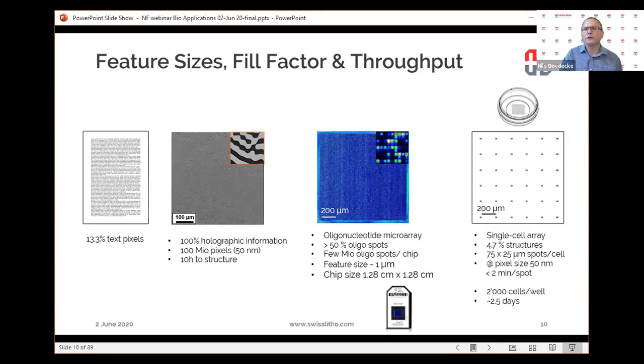I've been involved in a lot of single cell work throughout my career. And this is where I see, and I will get to this towards the end of my talk, again, why not make glass plates that have single cell spots that are somewhat modified, and then have a whole area of them, because we can then scan through the surface.